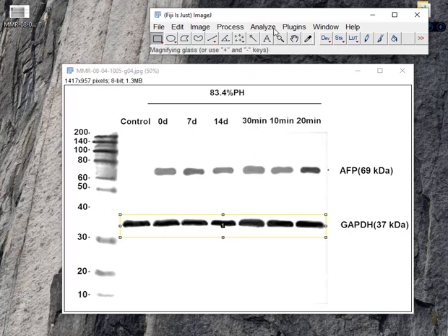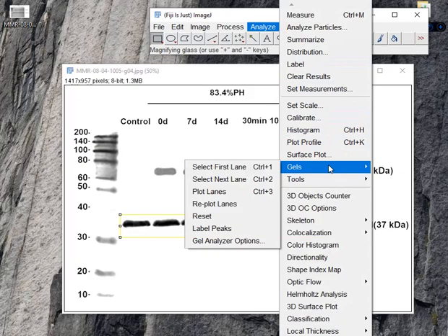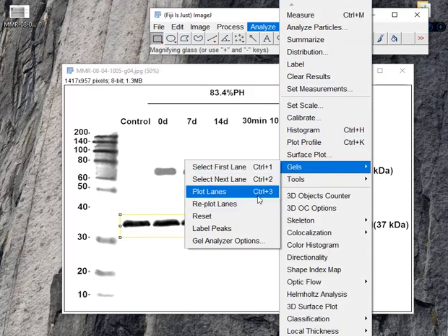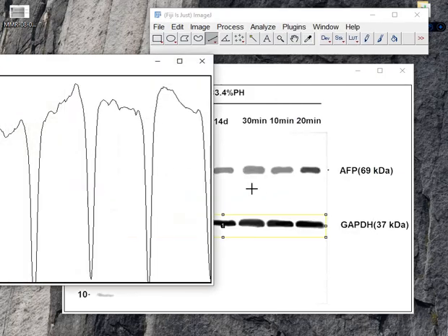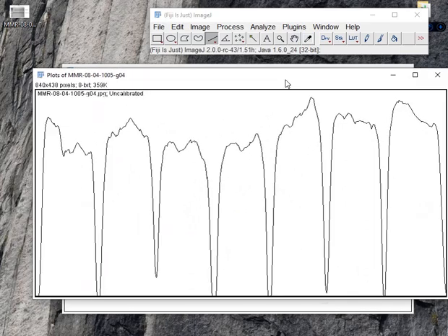Now the second thing you have to do is analyze gels and click the plot lanes. So all the lanes are plotted.